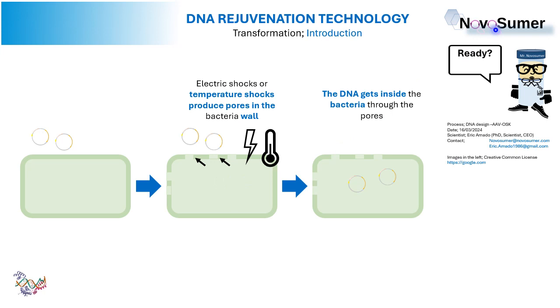Well, what happens next? Let's have a look here to the right. The DNA is already inside the bacteria cells. In this step, we will just simply try to recover the health of the cells. We will provide a nice environment, a nice medium, a nice temperature to help the healing of the cells.